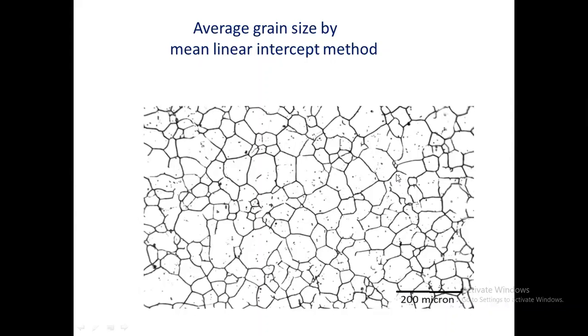When you take this image to other places or to a printout like this, the length of the image may change. So we have to consider the length of this line as 200 microns and convert it into our suitable scale bar.